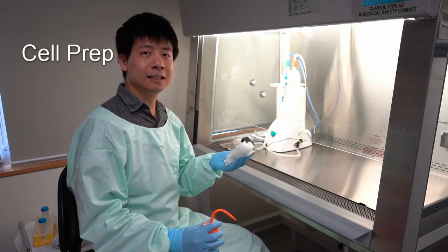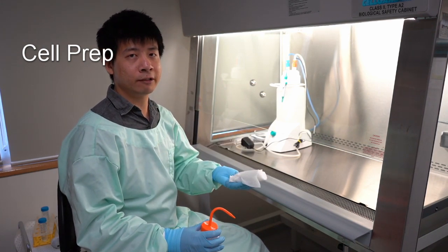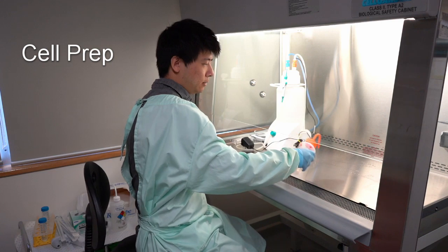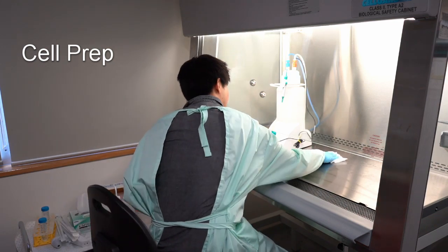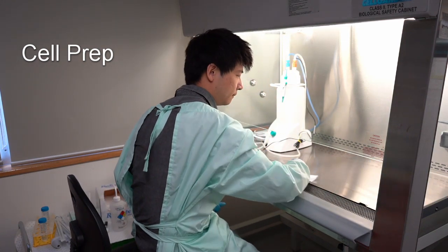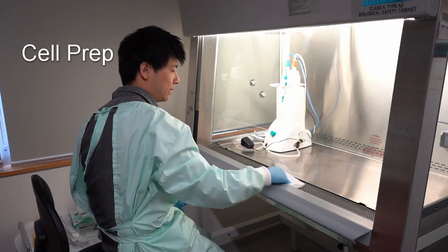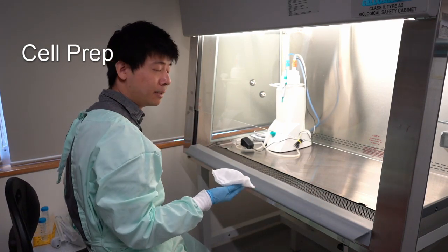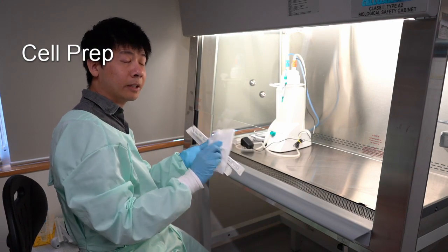The biosafety cabinet provides a sterile environment. Therefore, anything we bring in and out of the cabinet needs to be sterile. The first step before starting is to sterilize the workbench itself by spraying ethanol onto the surface and wiping it down. Once done, we can assume the surface is sterile. Anything brought into the cabinet, such as the pipette, must also be wiped clean with ethanol first.